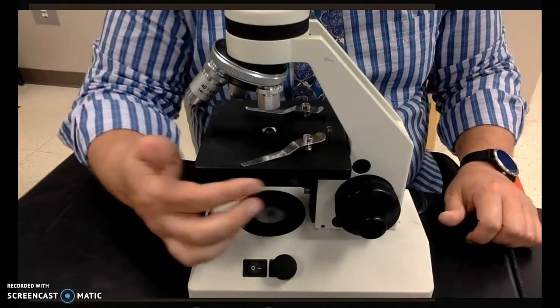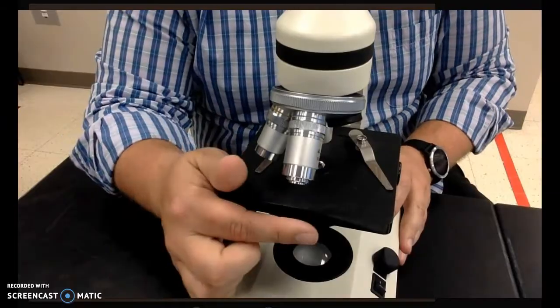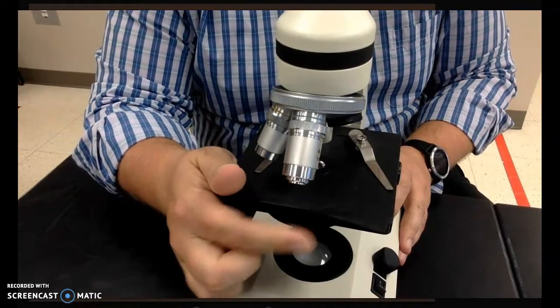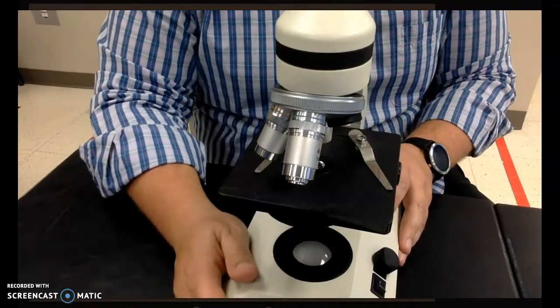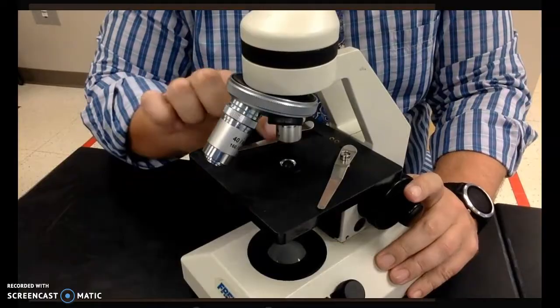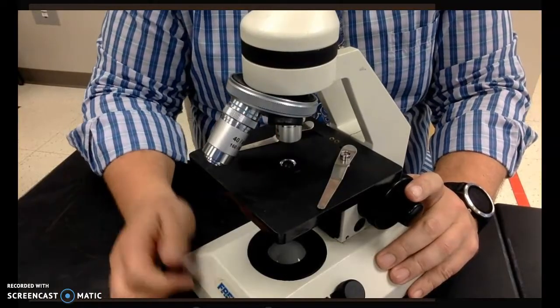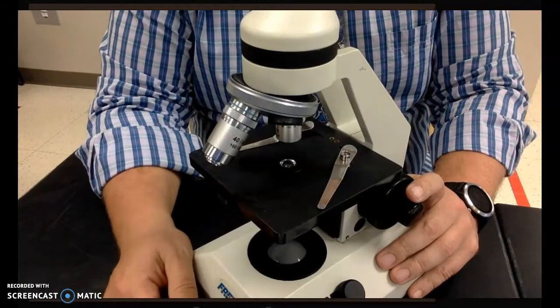Underneath the stage, we have what is called the diaphragm. I'll show you from a frontal view. The diaphragm actually rotates, and if you notice in the stage, there is a hole which allows light to go through. The diaphragm actually changes the size of that hole.